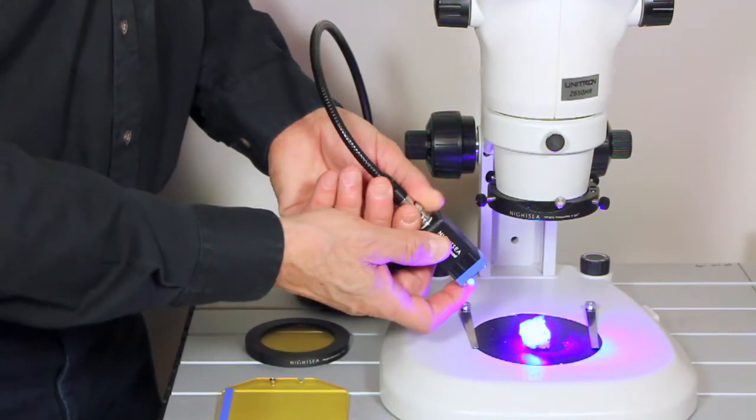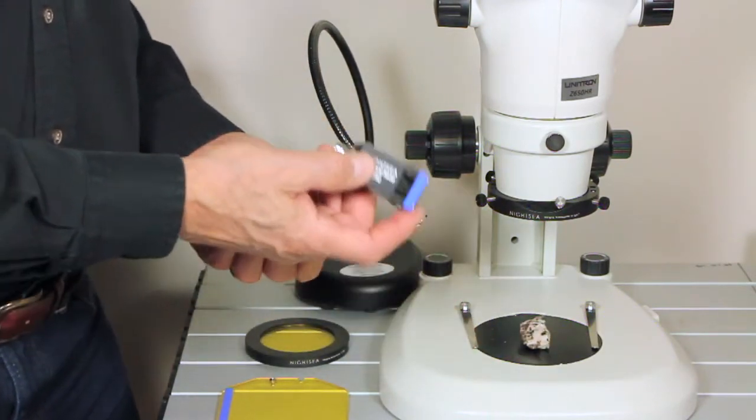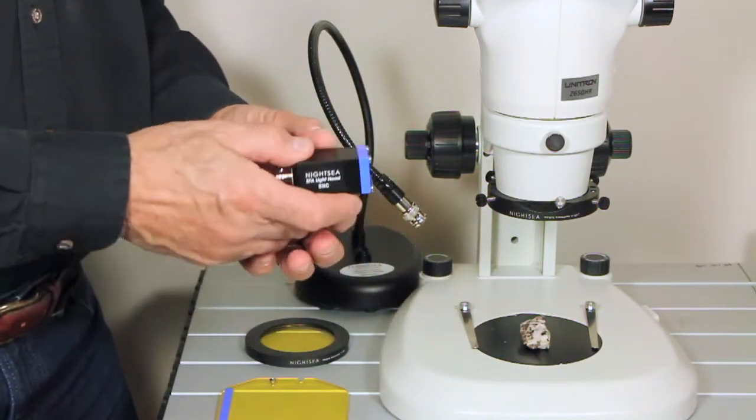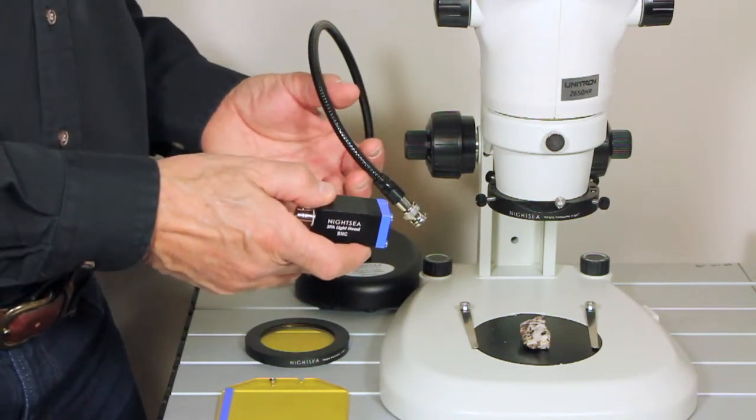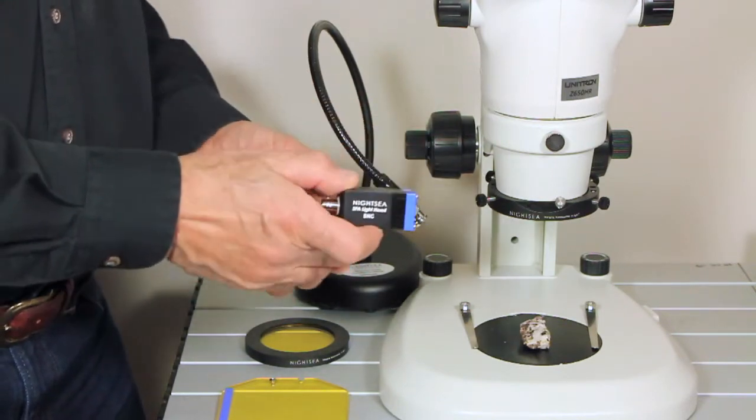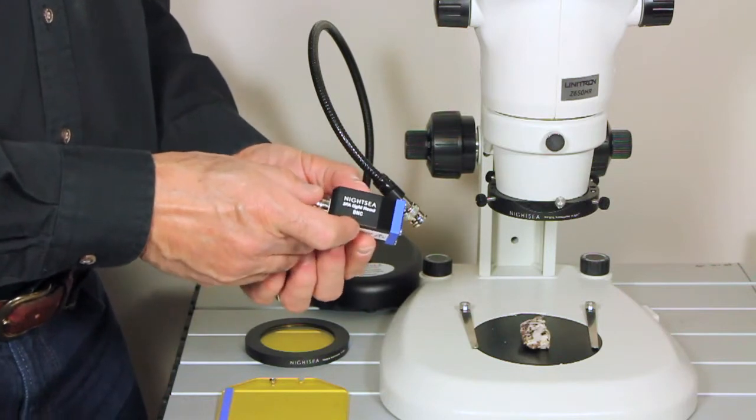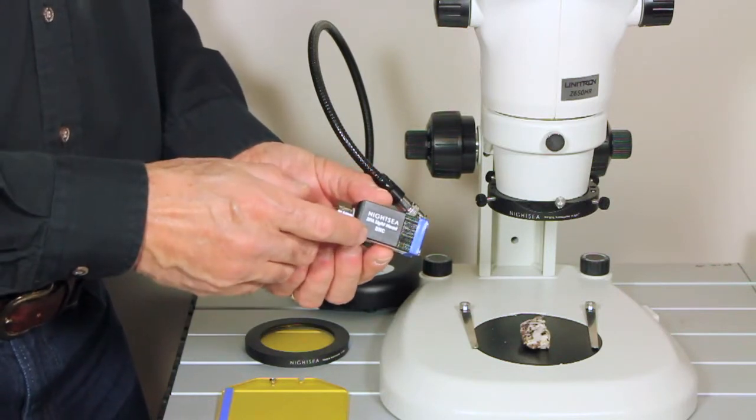Excitation we're doing with high intensity LED light heads. These are modular. So if you need a different color, you just put in a different light head. Each light head is dedicated to a color. It's not a white light source with a filter. This is the light source based on LEDs, colors indicated by the strip on it.